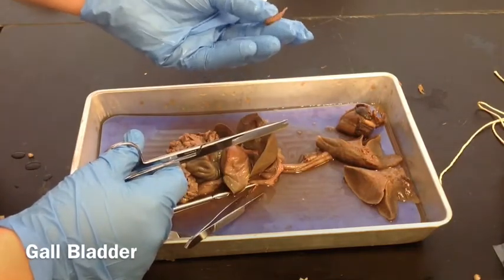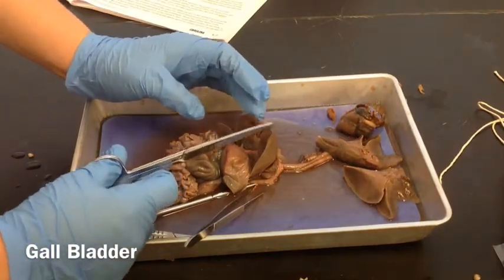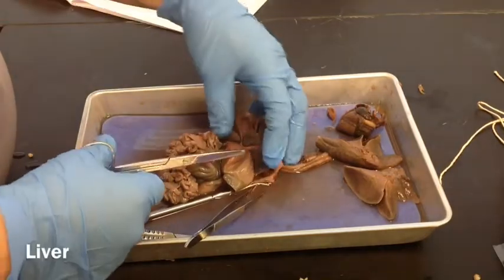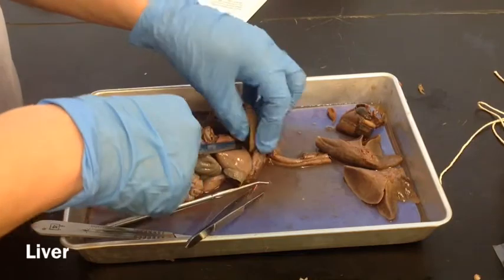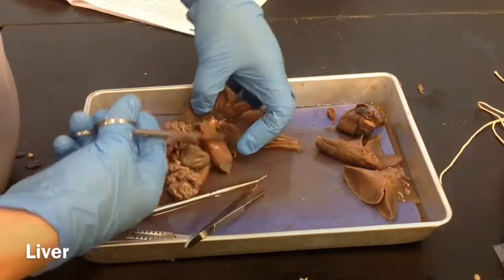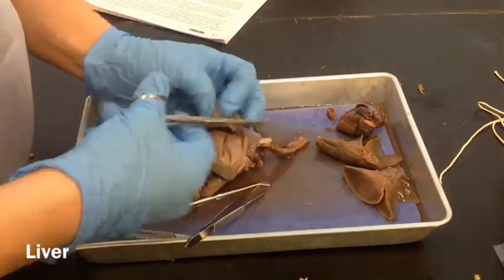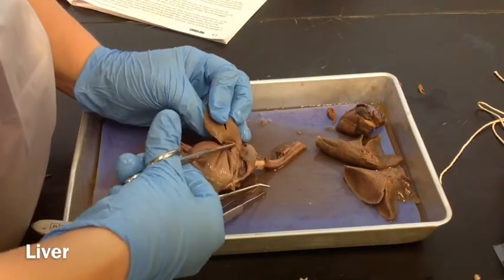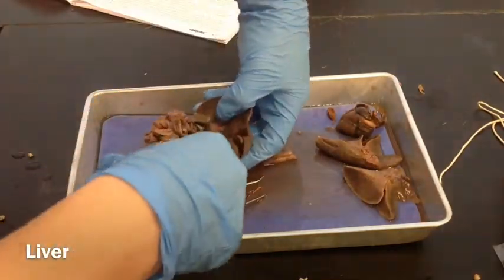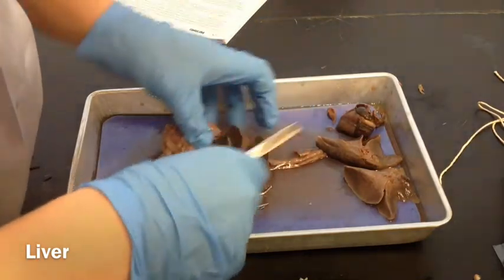Some people have the gallbladder removed if it's causing pain and problems. The next thing it tells you to do is to look for the umbilical cord — the umbilical vein. Remember the one that we cut earlier in an earlier step. So now we're going to cut out the liver. We're just going to snip some of this connective tissue down here. You want to take it all out at the same time. Make sure you don't separate the different lobes. Be careful not to cut the stomach while you're cutting the liver out. The liver is really, really big.